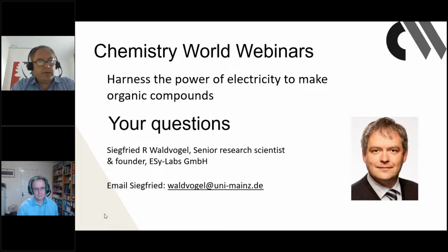And with the availability of the electrosyn, which was developed or co-developed by Phil Baran, it's plug and play now for them. I think it's at the moment a certain hype, but it will stay there. It will not be just a wave. It will be accepted. It's a method. Compared to photochemistry, electrochemistry is easily scalable, and scalable over a large range.